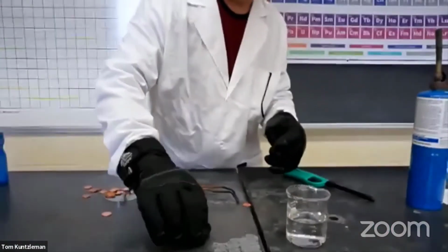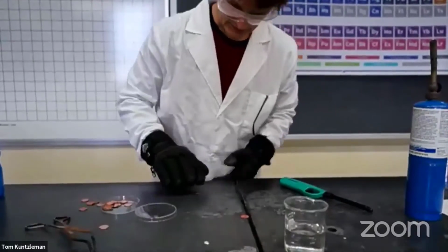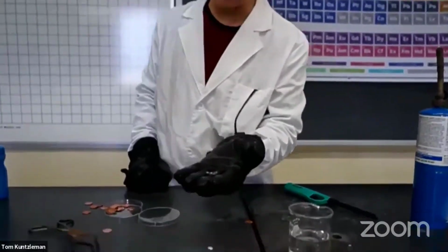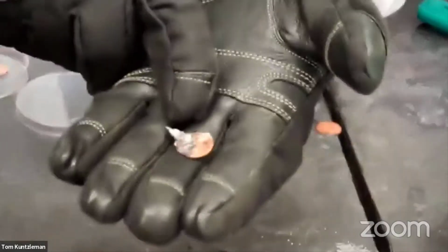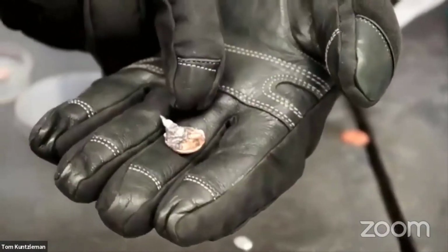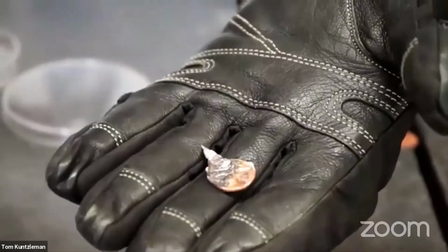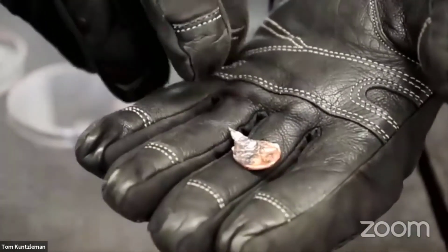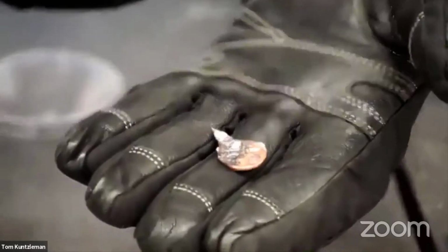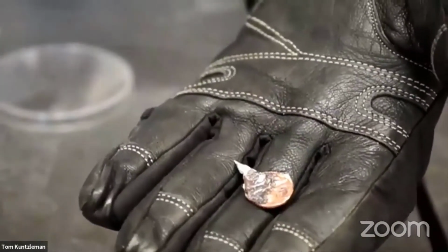I'm going to try this one more time because sometimes when I do this experiment with these zinc pennies, the new pennies, sometimes when I do it, I see brass form. Well, what's brass? I can see a little bit here, but I'm going to try to do it where it works a little better. Brass happens to be a mixture of copper and zinc. So to speak, when the copper and the zinc melt together, they make brass, which is like a golden color. Brass is a golden color alloy. It's a mixture of copper and zinc.